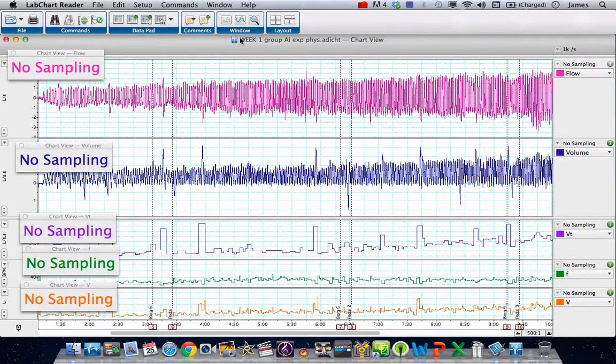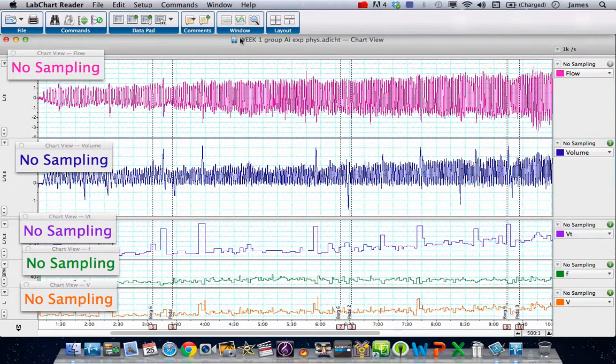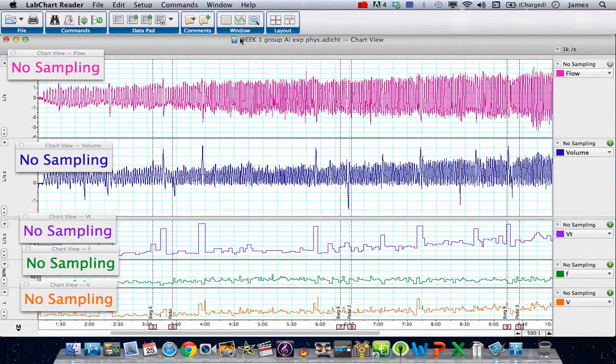Hello, it's Dr. Clark here again. We're back on LabChart Reader for the Mac and this is part two of the tutorial looking at the conversion of flow and volume recorded on the respiratory pod on a PC in the lab. But now we're using LabChart Reader which doesn't have the module or the pod, so we're trying to interpret some data from these.